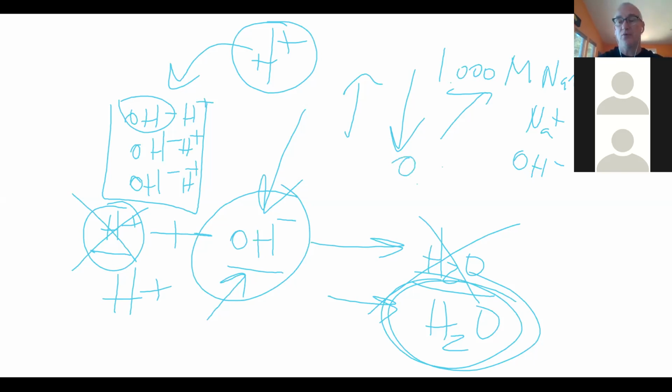I'm going to have like 0.996 or 0.992 or some smaller concentration. I don't know what smaller concentration it is. But if I'm going to use this to titrate something later, and that's what we're going to do in the second part of the experiment, I'm going to use that solution to exactly measure the amount of acid in a solution. I can't do that precisely if I don't know what the actual concentration is.